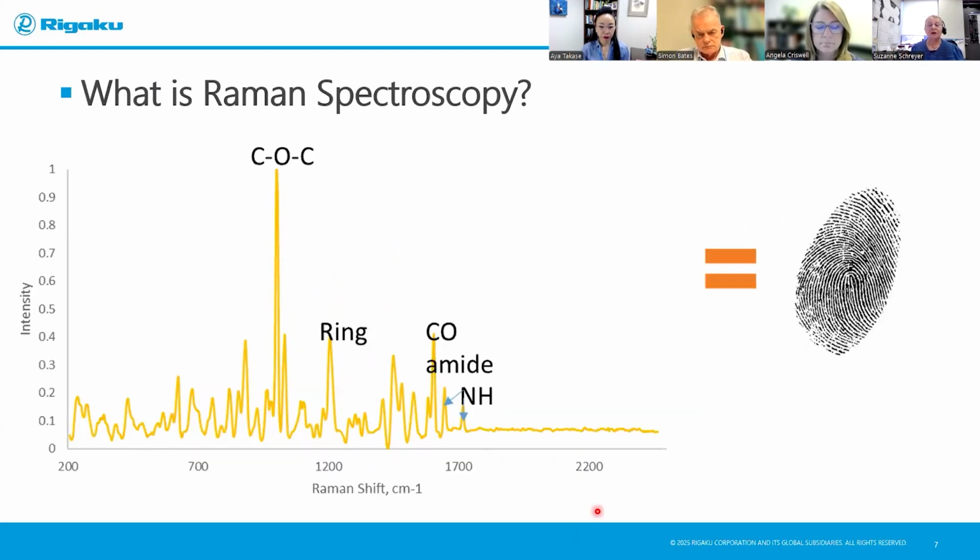So a Raman spectrum is shown here. We have the Raman shift. You can assume that there's a big Rayleigh filter line set up here to filter out anything that's just elastically scattered. And here we're seeing the result along the Raman shift line of what the resulting peaks are. As you shine energy onto a molecule, it does a stretch, a bend, or a waggle, and each of those has a characteristic frequency.